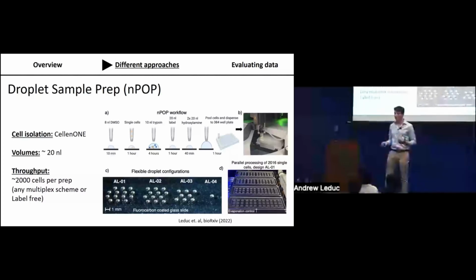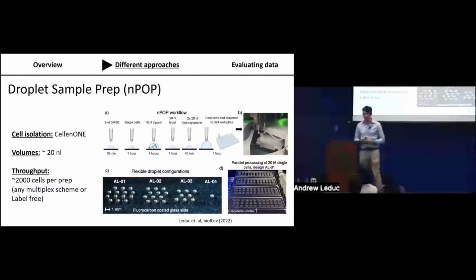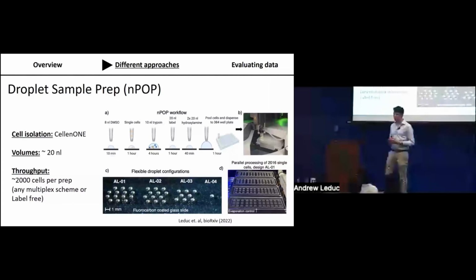We're not using it for quantitative measurements of fluorescence. I think it works well for on-off expression, or things of this nature. But I know they have plans to improve it, or do some work validating the extent to which you should rely on the quantitation from these fluorescent readouts.